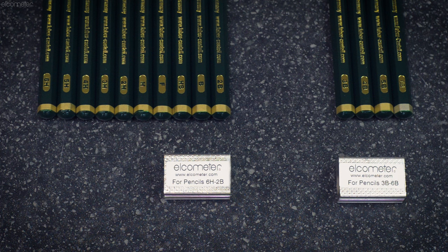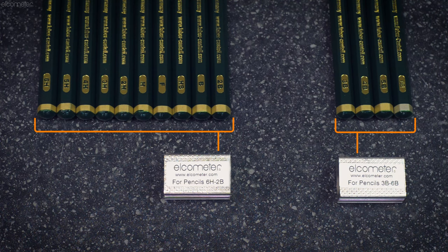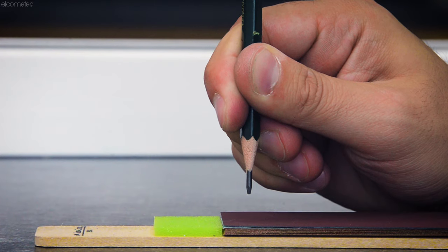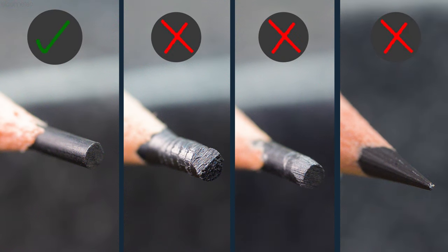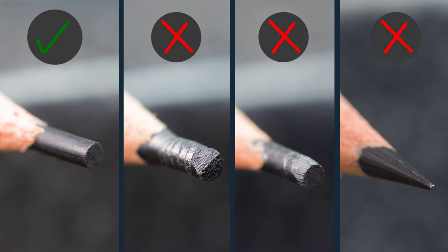Please note: there are two different sharpeners provided to suit the different hardnesses of lead — one for softer pencils, the other for harder pencils — so use the correct one accordingly. Next, hold the pencil at 90 degrees to the abrasive paper provided and rub the lead until you achieve a flat, smooth, circular cross-section which is free of chips or nicks.